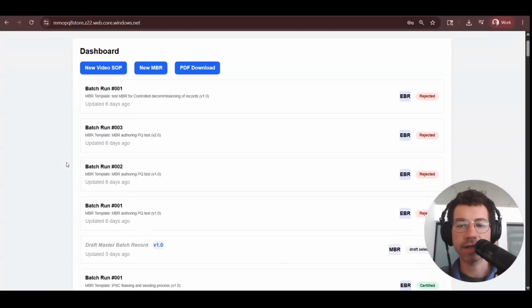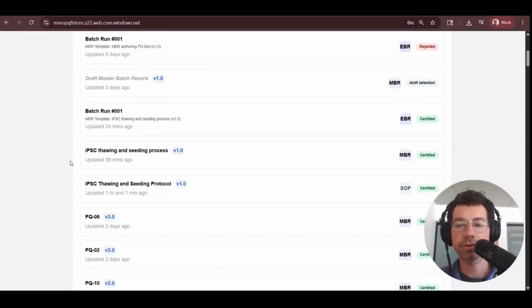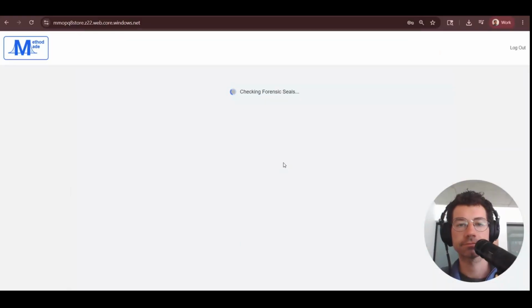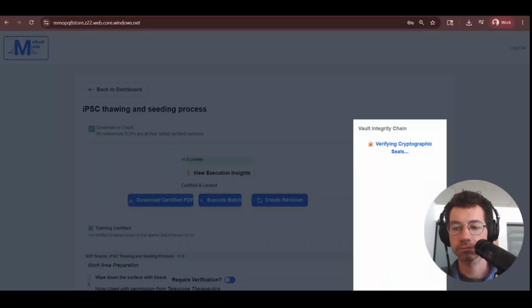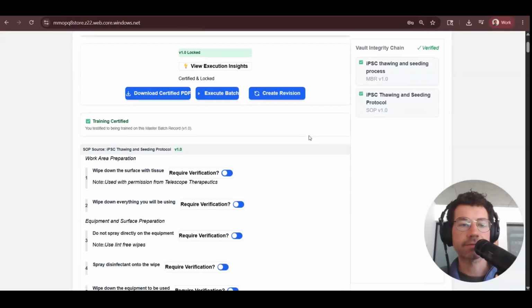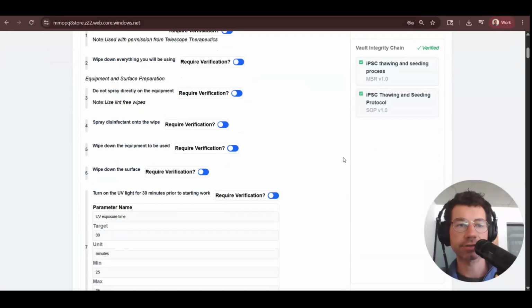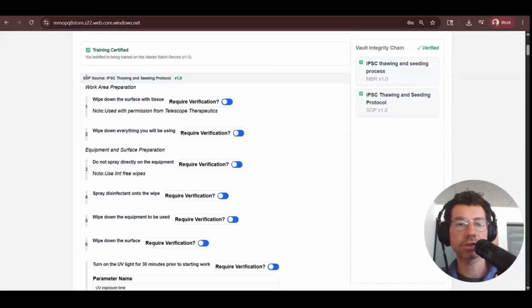Okay, so now in this video, let's go through a master batch record created using the video SOP in the method made system. Okay, so what you see for master batch records is the title of the batch record, and you will see sectioned off SOPs.